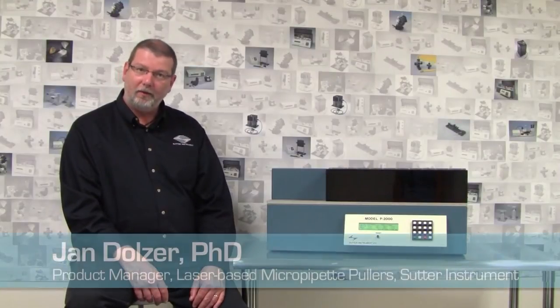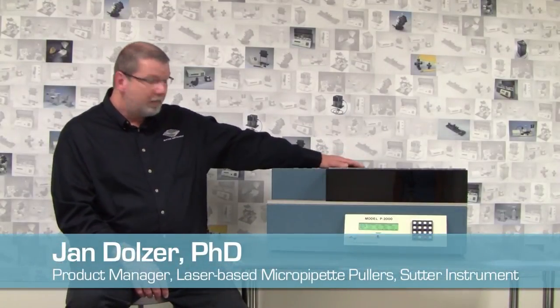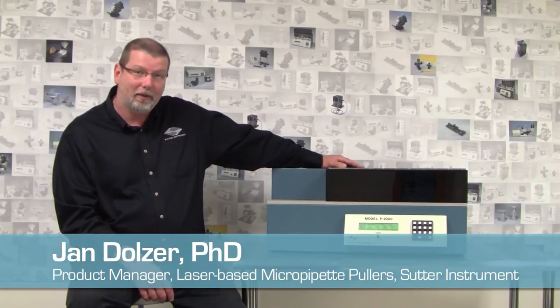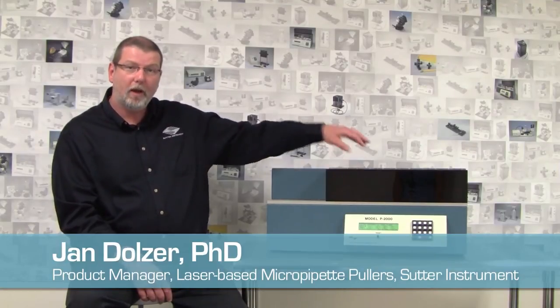Hi, I'm Jan Daltzer, product manager for the Sutter Instrument P2000 laser-based micropipette puller. What I'm going to show you today is something you can think of as the birth of a glass pipette.